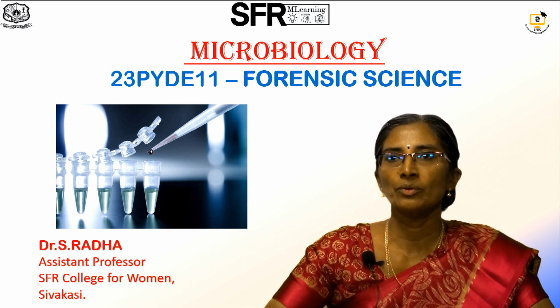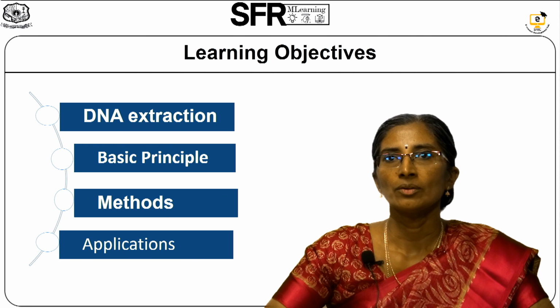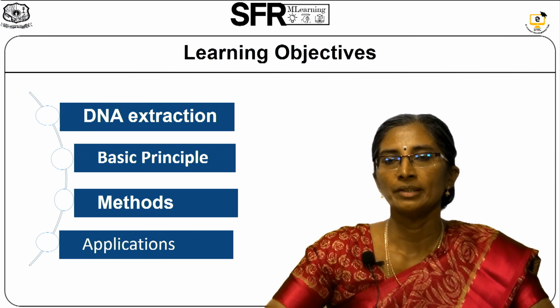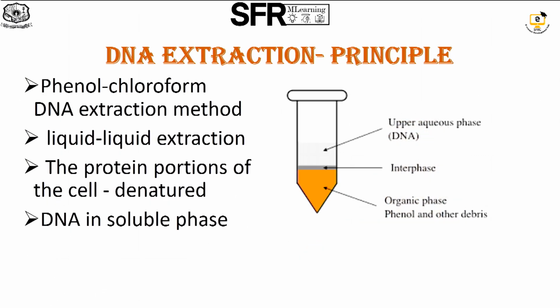So I am going to take a topic of forensic science. Under this we are going to see first the DNA extraction method. I am going to discuss the basic principle of DNA extraction and how the protocol is performed, then where and all it is applied. So DNA extraction principle first we have to discuss.